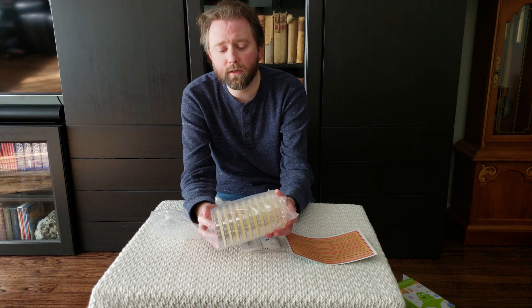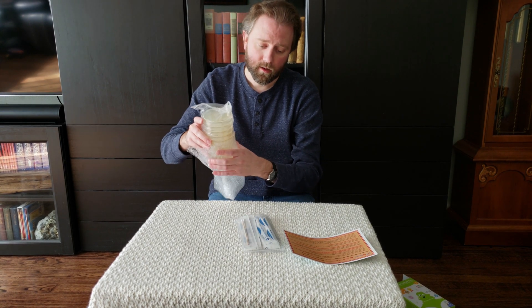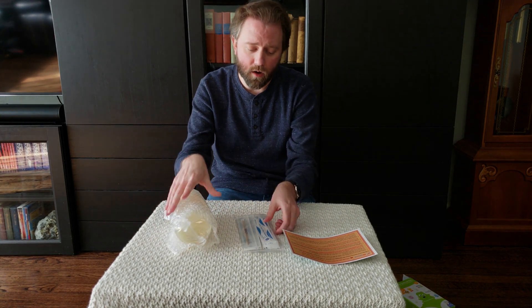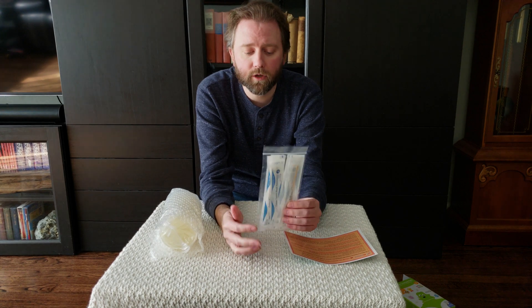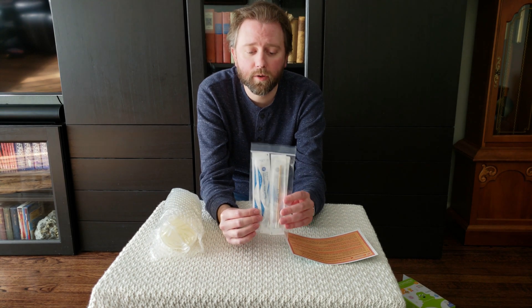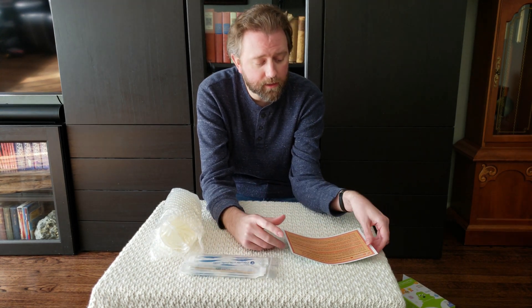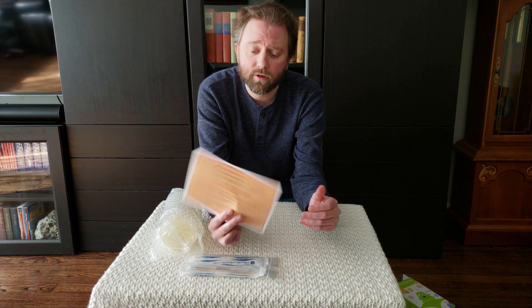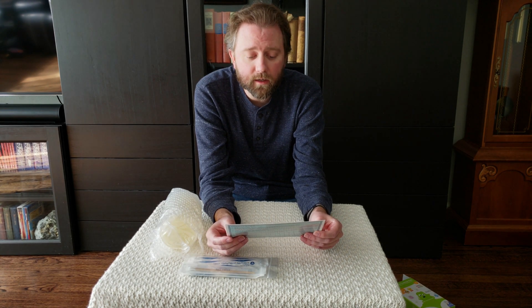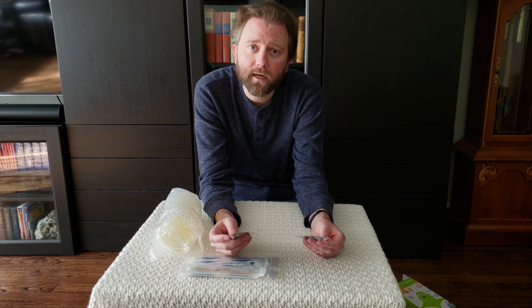You're going to get 10 little Petri dishes, already prepared for you. This is what they look like once you open the bag — then you can open these and transfer your specimens in. You also get all the little Q-tips: one, two, three, four, five containers with two per container, so that's exactly 10 swabs total. That's basically everything you get in the kit.